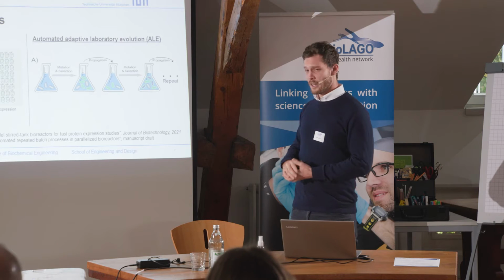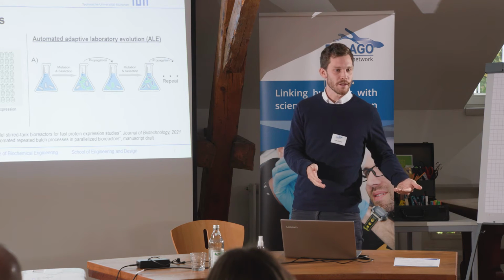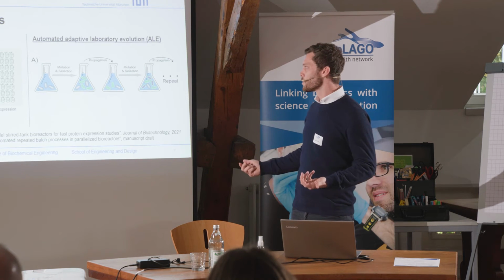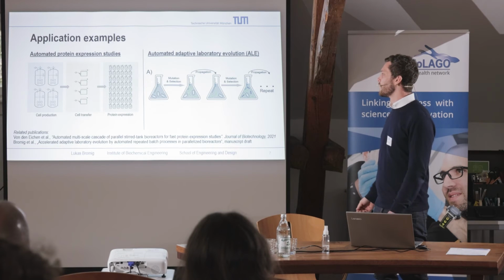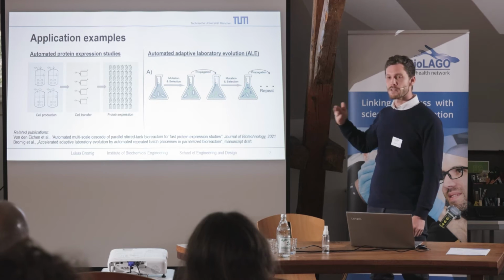So ideally, we want to start that process on Monday in the liter system, and then get back on Friday, clean everything up, and have the data wherever we want it. Yeah, and we use SiLA for that to orchestrate all this, and orchestrate it with Python scripts. So this was the first use case, and then we had several others.